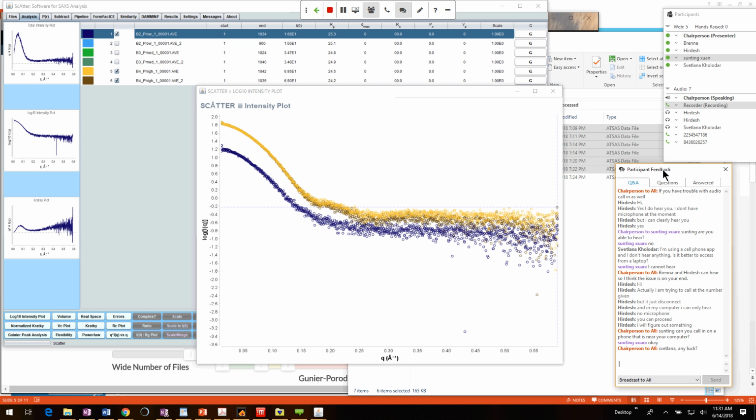So it's totally okay to do what you're doing. There are a few exceptions. If you have an iron sulfur cluster, some kind of metallocenter, those, if they get charged up, can blow apart and you lose some structure there. But generally, that's how that goes. Does that answer your question? Yeah, that was definitely helpful.